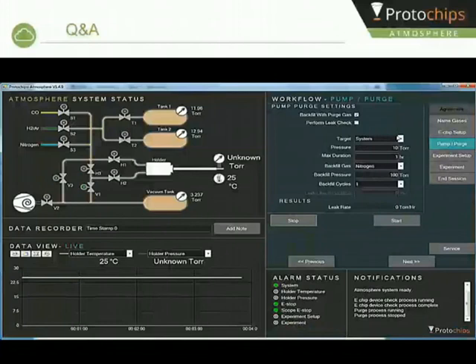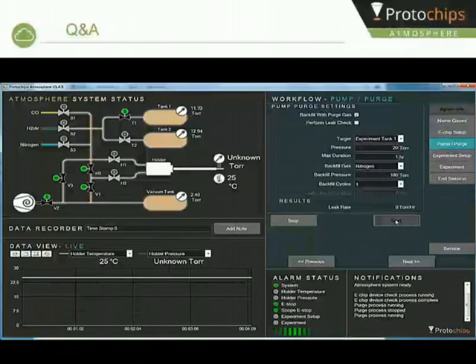We've often tested our heating chips, and this is true for our Duro system as well. Our typical test for age would be to test the chips over a 24-hour period, and even longer soak times, and then measure at the temperature throughout that test. We've been able to maintain accurate temperature through those long soaks. So I think that would definitely be an appropriate time for these types of experiments.